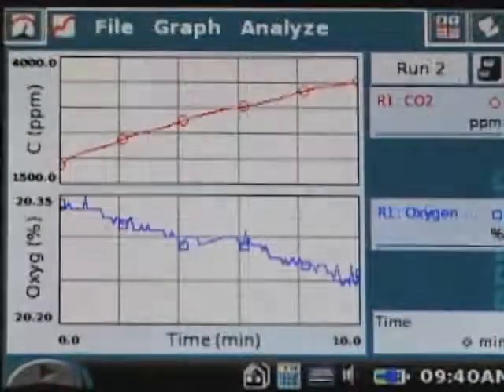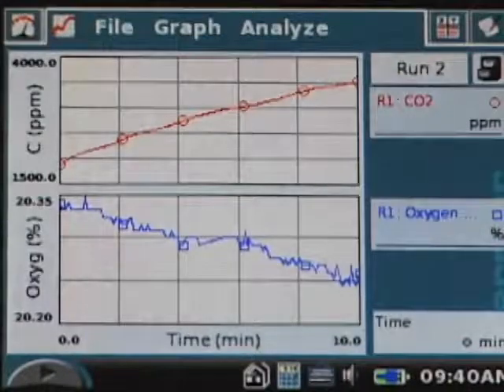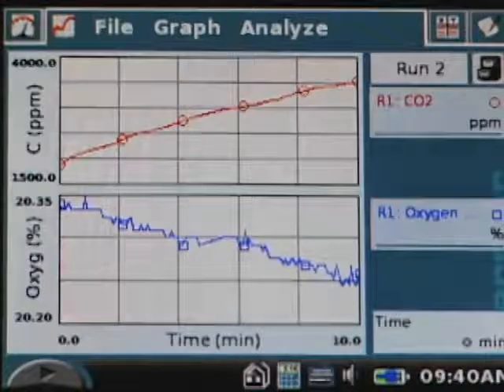After 10 minutes, when data collection is finished, remove the sensors from the chamber, pour out the peas, and fill the bottle with water to flush out any remaining CO2. To find the rate of respiration, we need to find the slope of the CO2 and the O2 graphs.